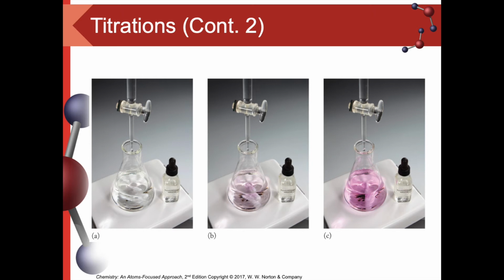You can see the bottom of the burette. And then there's a little bottle there, and that bottle is our coloring. That's a pH indicator. It's usually phenolphthalein, and you add a little bit of phenolphthalein in there, and then theoretically, when you have your acid and your bases and they neutralize each other, it should give you a nice pink color. You should have a color change, theoretically.